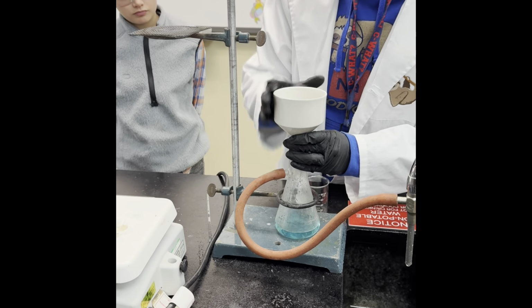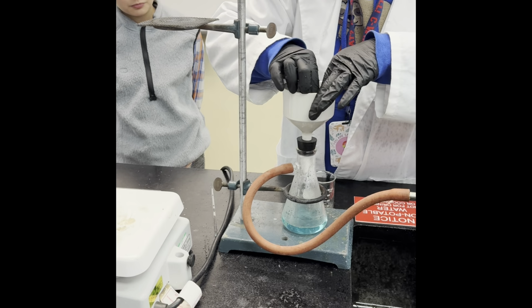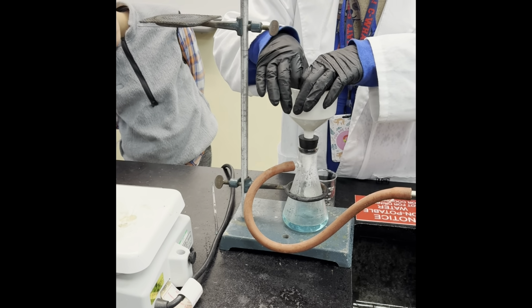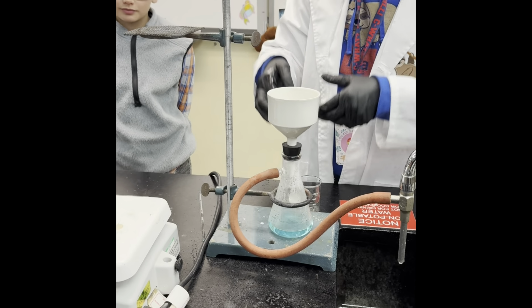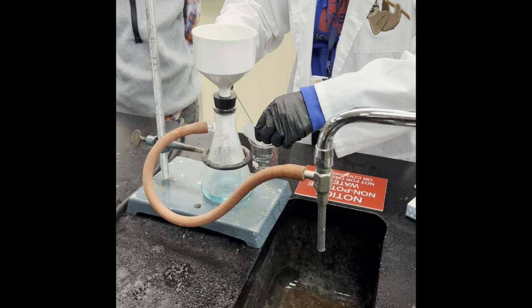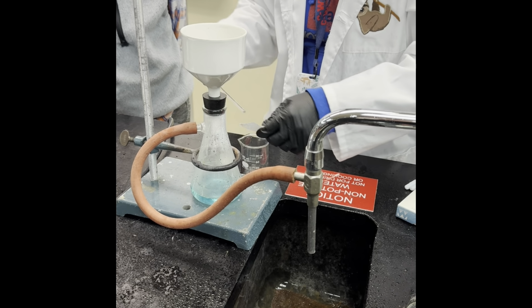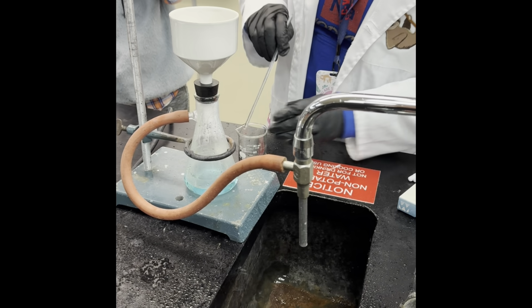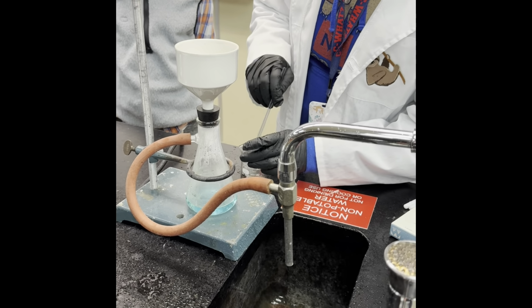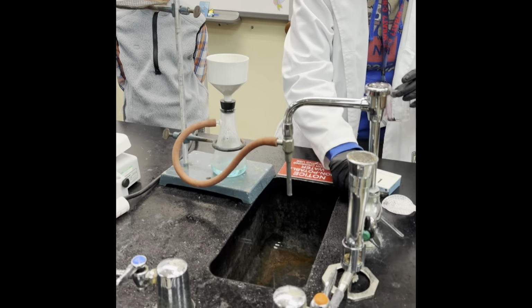I'm just removing the funnel, or the filter paper. So there was a piece of filter paper in here to trap the solid. That is right. And if we left it on there long enough, we could get the solid to fully dry. But think about, don't tell him, Cooper, why do we want the solid to fully dry before we take a final mass of our product?